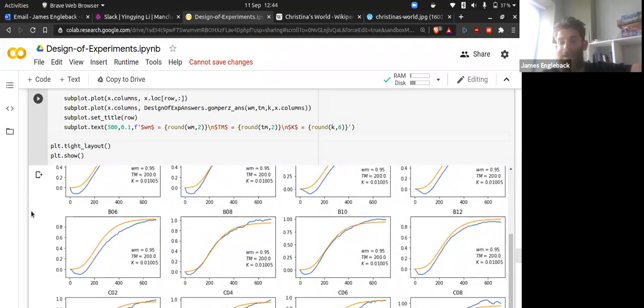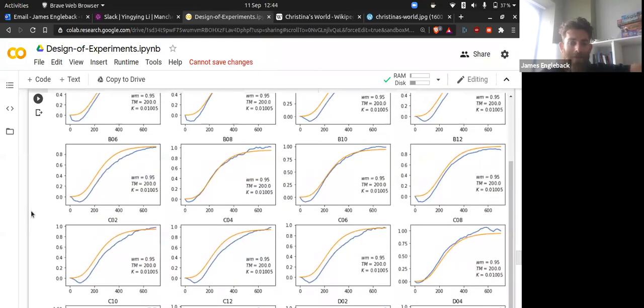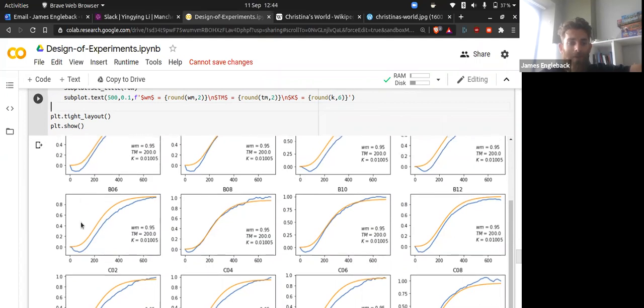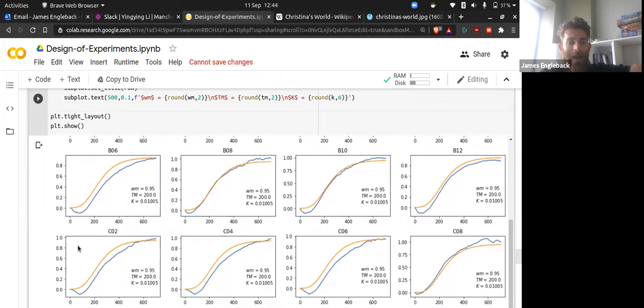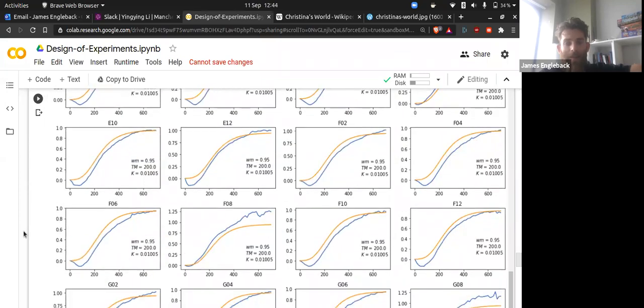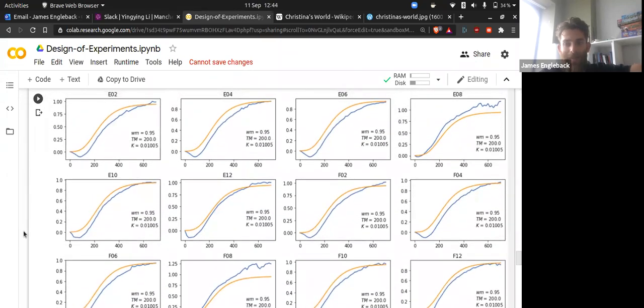But it's okay, it was just a pilot run, and this is exactly what pilot runs are for: identifying issues and bugs and so on. So for the next round of experiments, I suppose I'll need to find out what this initial dip in OD was from the 0 point and address that. But yeah, it seems to be fairly ubiquitous.